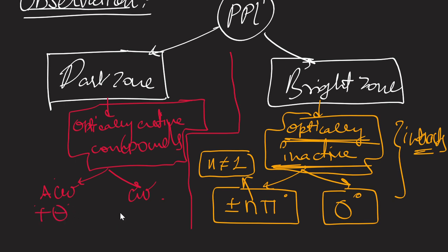If it is located 2 degree clockwise, you can see a bit of change in it. You can imagine it in your mind also. It's a bit tilted.